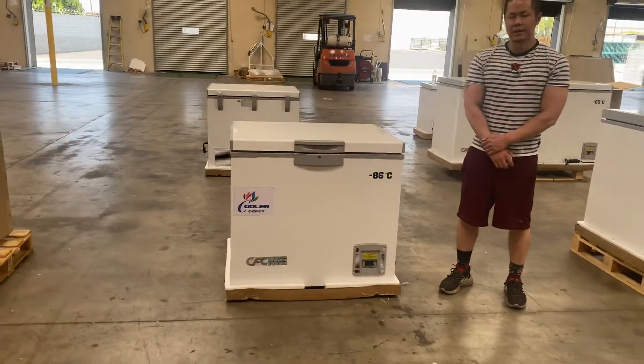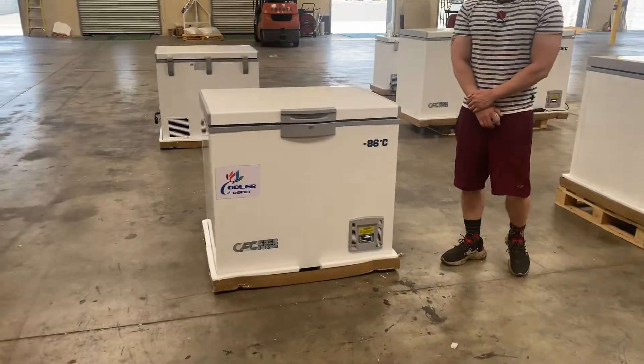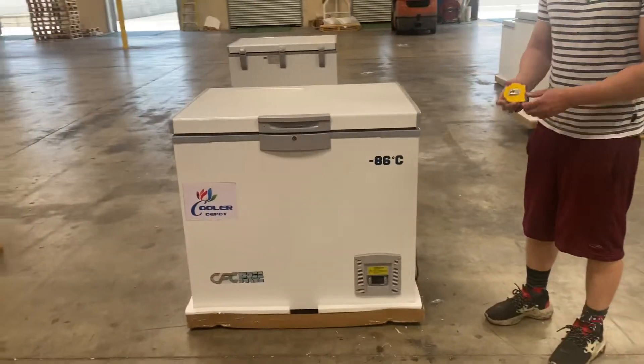This is our negative 86 degrees Celsius medicinal storage vaccine chest freezer. First, let me show you the dimensions for this box freezer.